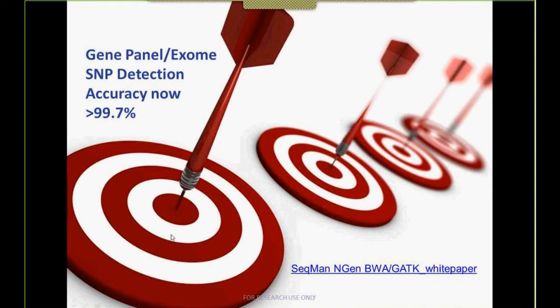Our focus initially was speed. So when we first developed these algorithms several years ago, we wanted to be the fastest thing out there. We want to be able to crunch through a lot of data.